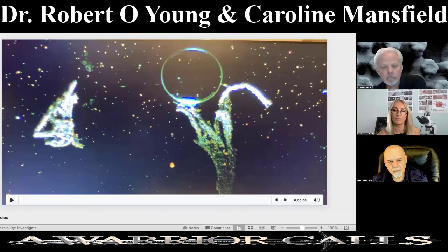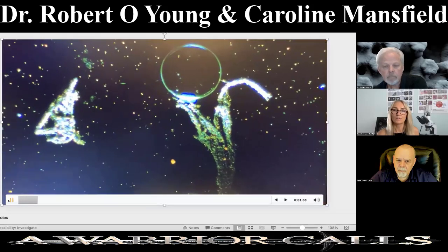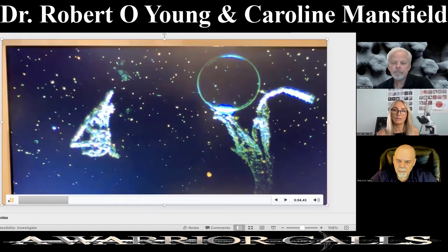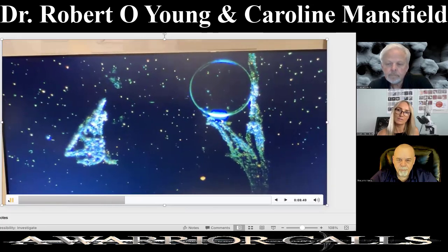Now, this is from the capsule of a vitamin D supplement. And I was able to dissolve the capsule, and then all these, we've probably seen this before, these black particles came to the magnet when I dissolved it in some water in a cup. And so I put these black particles under the microscope and had a look at it, and they were highly magnetized.